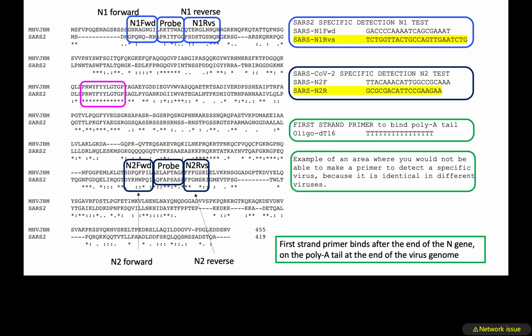Quantitative reverse transcriptase PCR is just really, really useful and very widespread, and frankly, even fairly basic hospital pathology departments will have one of these machines in there so that they can do this technique, because it is, frankly, the gold standard for detecting not only what's going on, what kind of RNA was present, but checking how much of each RNA is present. So there you go.